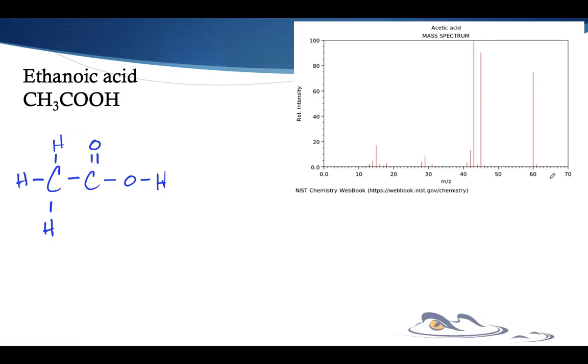I can come down here. I see this really big piece at 60, and I can see, hey, that's the molar mass of it, right? 24, 32, and 4. So we put all those together, we're going to get 60.